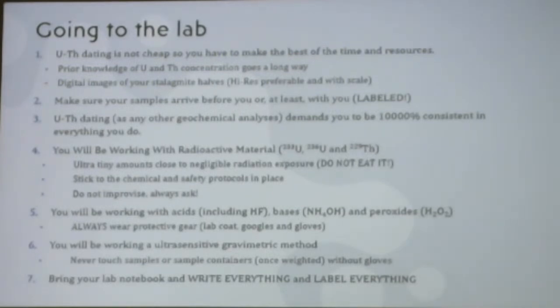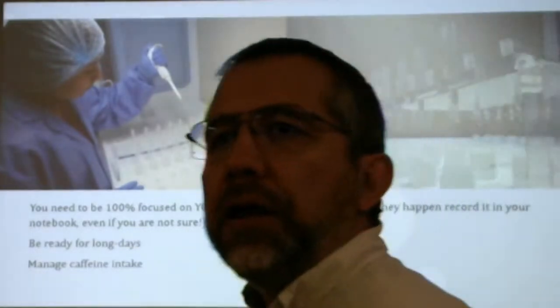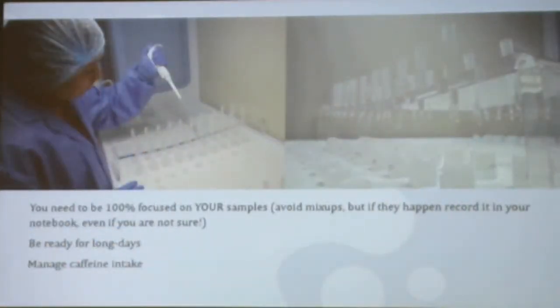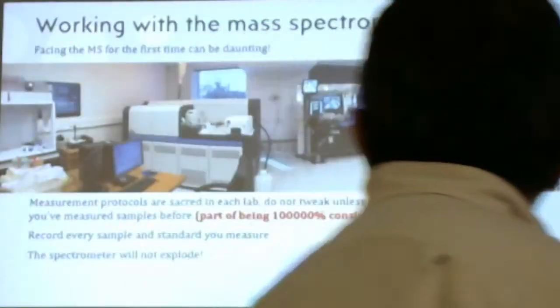Write everything, label everything. That's very basic, very important. You need to be focused on your samples. So we usually tell students who are coming to the clean lab to forget about life, enjoy the clean air, relax, put on some music. Very important, manage your caffeine intake. And I'm serious. Why? Because you will be pipetting into different columns, and if you take 5 cups of coffee prior to your lab work, your hands will be shaking. I'm speaking from experience. So yes, manage it.